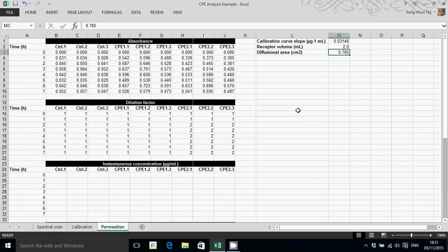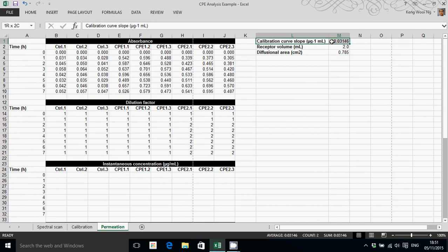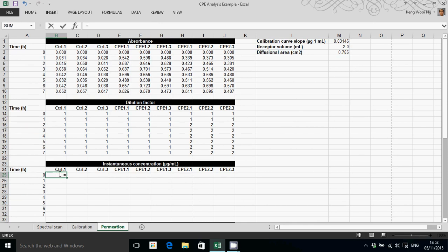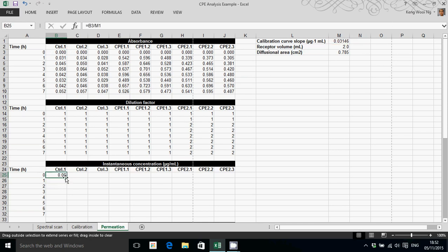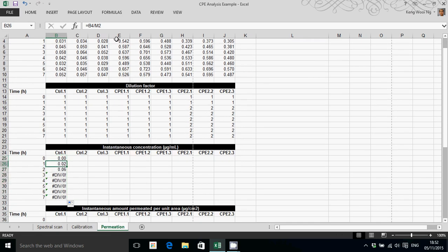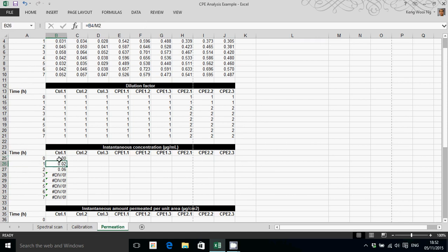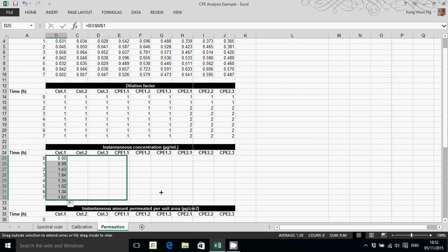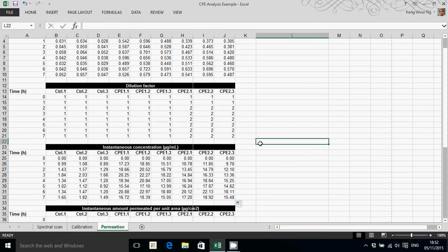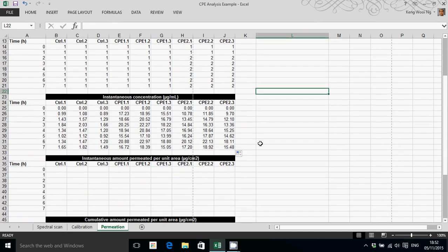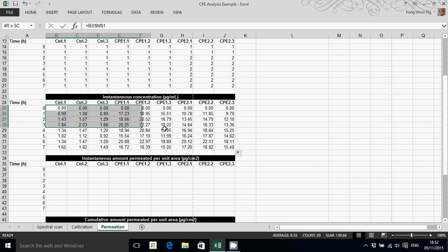In order to convert absorbance to concentration, you'll make use of the calibration curve slope. The calculation is very simple. Simply that is absorbance divided by the slope of the calibration curve. That gives you the concentration of the sample that you actually measured. And you just need to fix that cell by putting a dollar sign in front of the column and row numbers. Do that for all of the samples. Now at this point, we haven't taken into account the dilution factor. We'll do that in the next step.